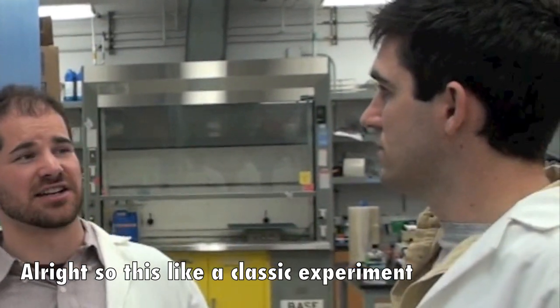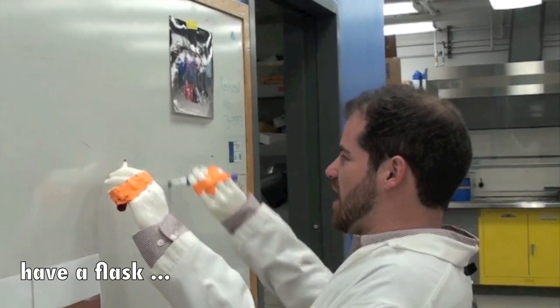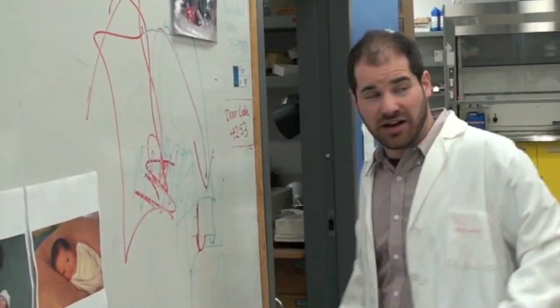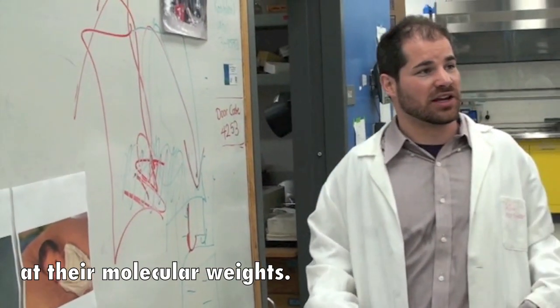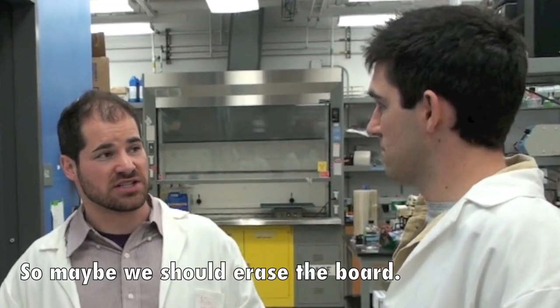This is like a classic experiment that we do in molecular biology. We have a flask. And then we're gonna see bands that represent our DNA at their molecular weights. Okay. Sounds great. It's all clear? So maybe we should erase the board.